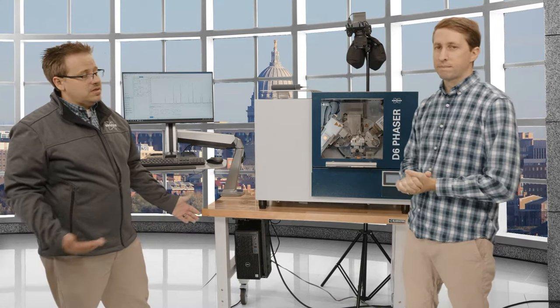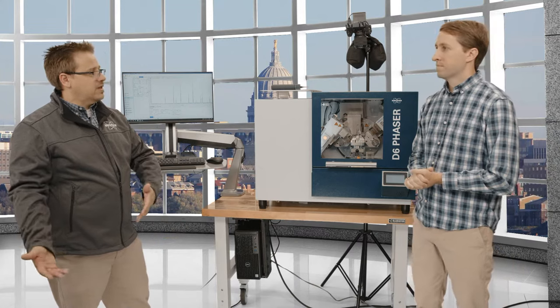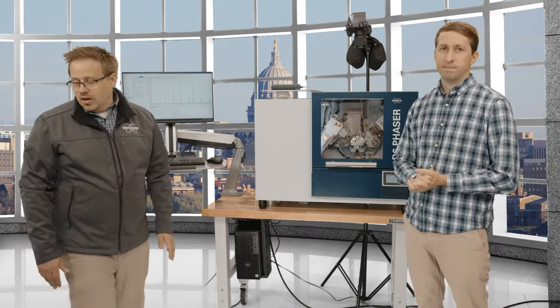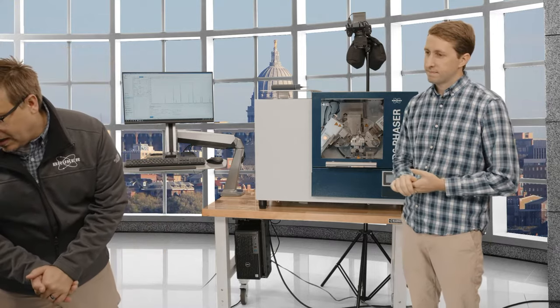And it writes those right into the database, so you can go ahead, access them, and see how your intensity is changing, especially tracking it over time. Yeah. All right, next question from Francois.